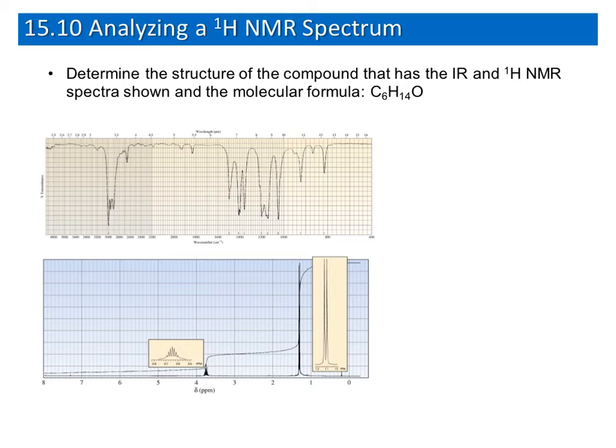If you look at this signal, the step curve starts from here and ends here, so it includes 1 unit, so we can say the integration here is 1. And for this signal, the step curve starts from here, so we have 1, 2, 3, 4, 5, and 6 units. So it can be integrated as 6 hydrogens.